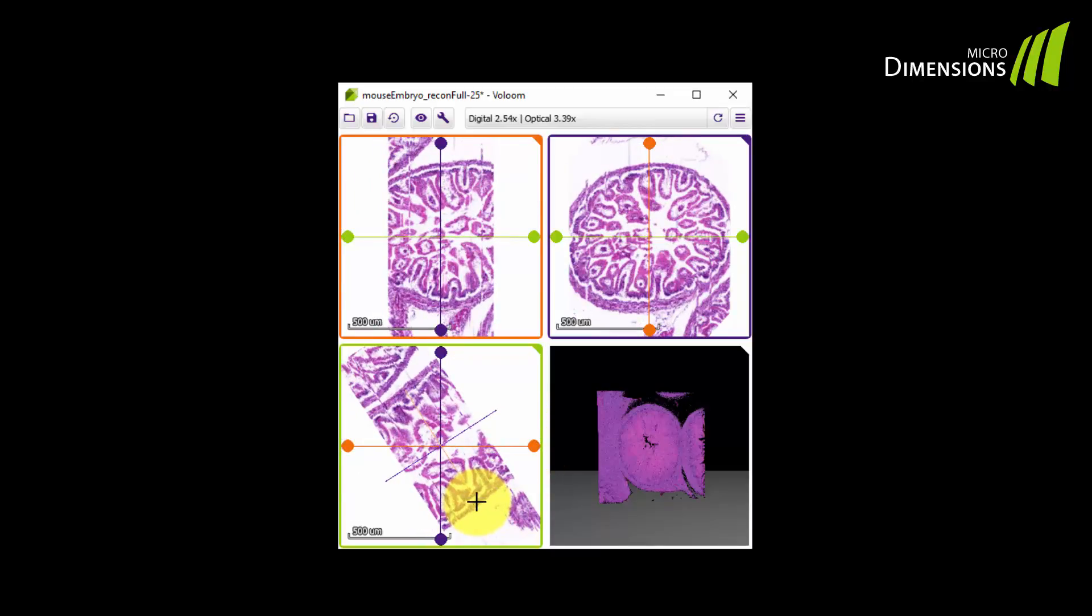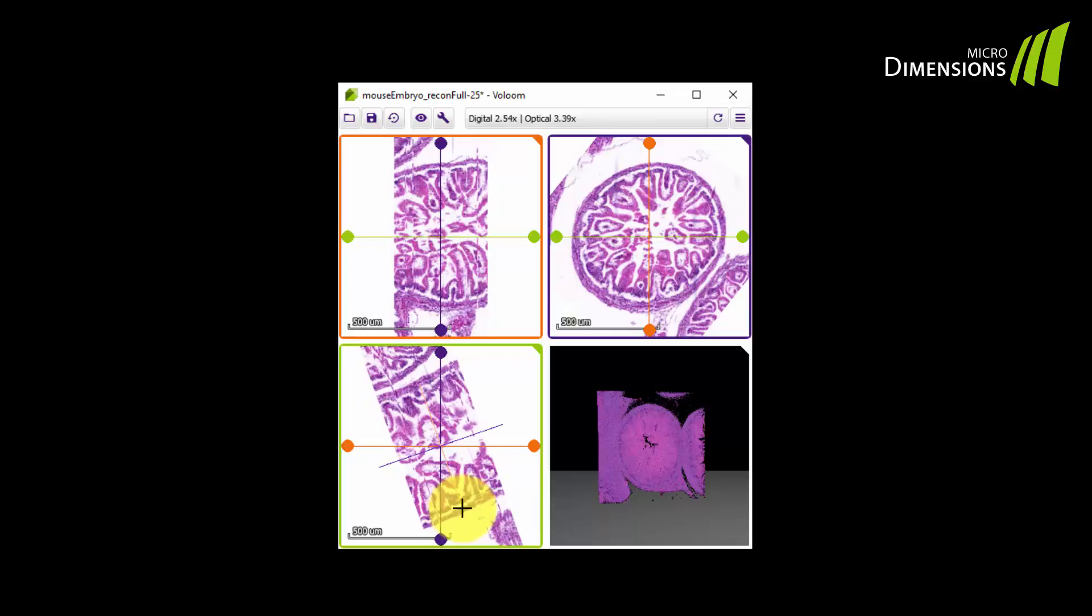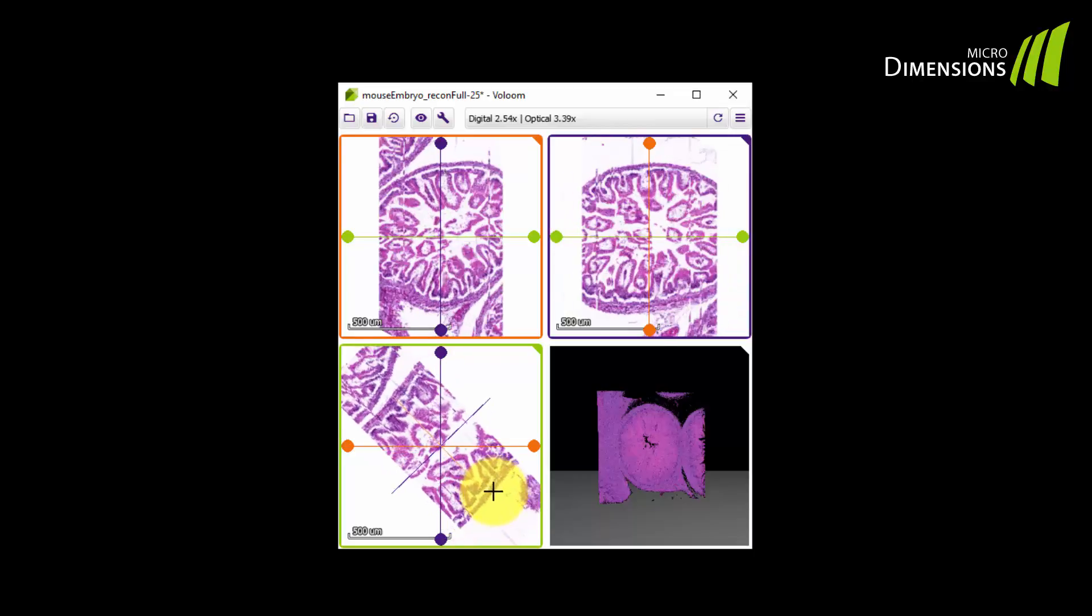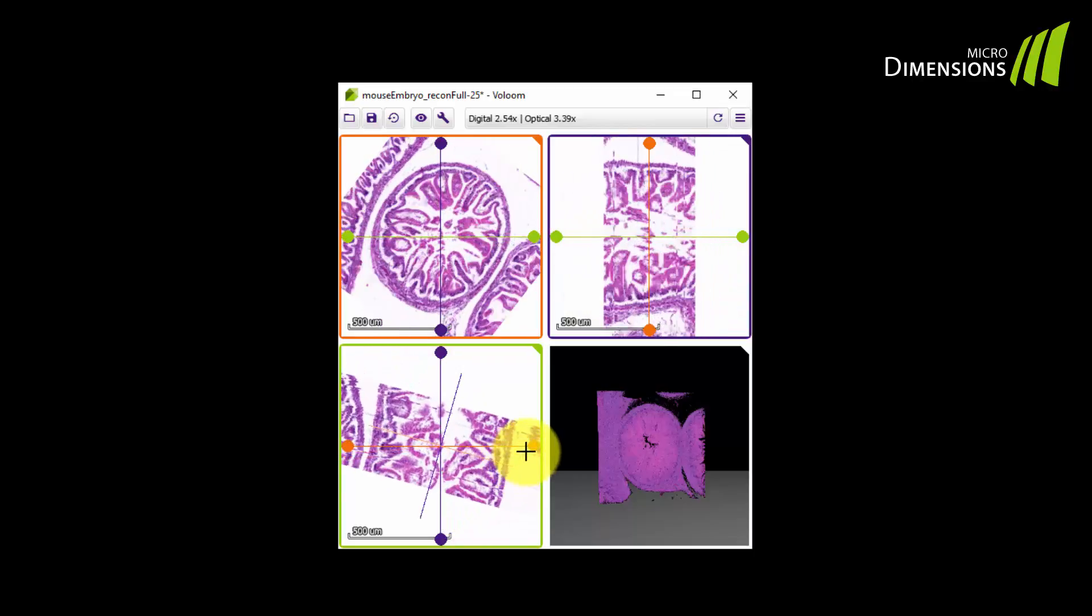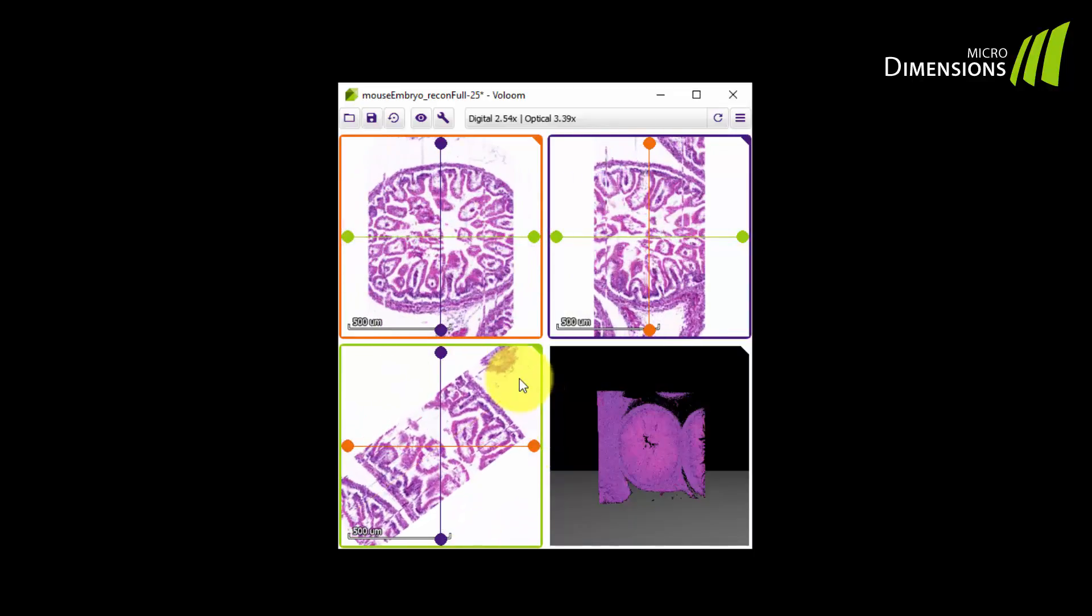Correspondingly, the other two virtual cuts are updated as well as the virtual cutting plane changes. A click on the reset button restores the default view again.